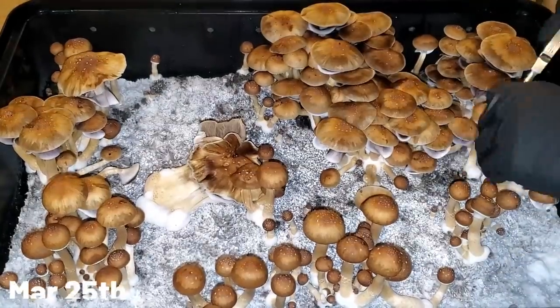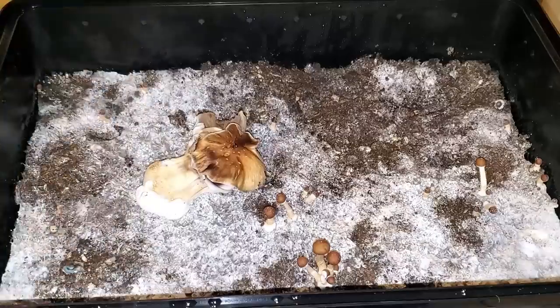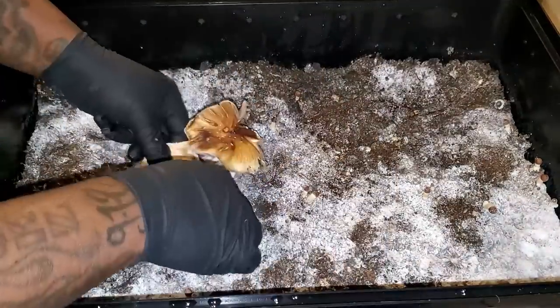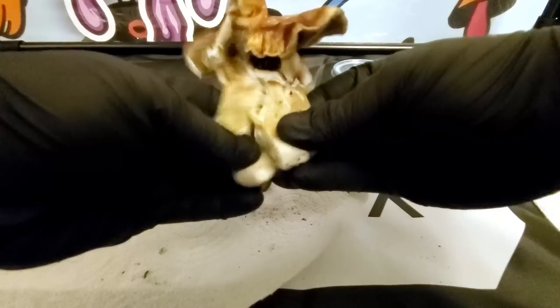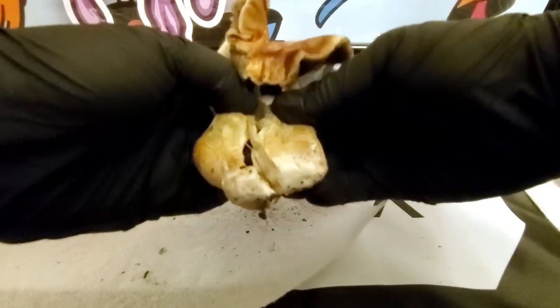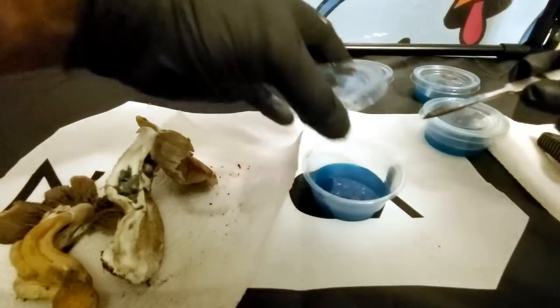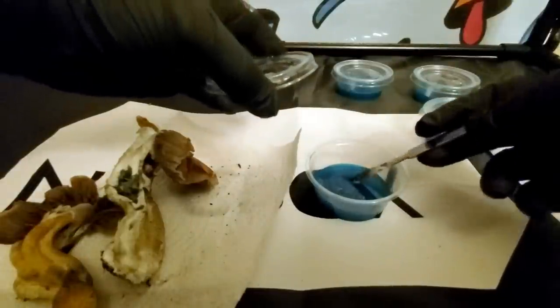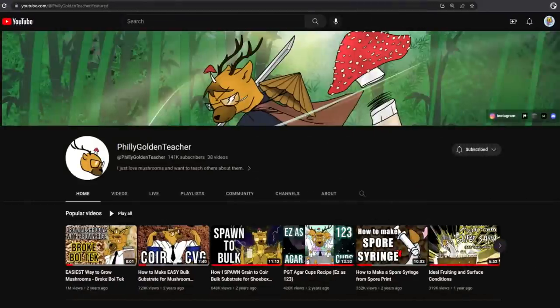On March 25th is when I did the first flush on the North Spore grow. In that video you saw this monster-looking mushroom, and also in that video I showed you guys how to clone a mushroom — it's really easy to do. In this video you're going to see what the next steps are after you clone your mushroom.